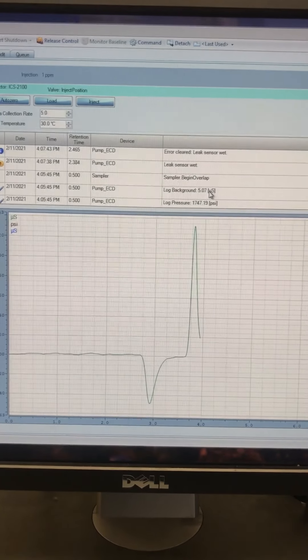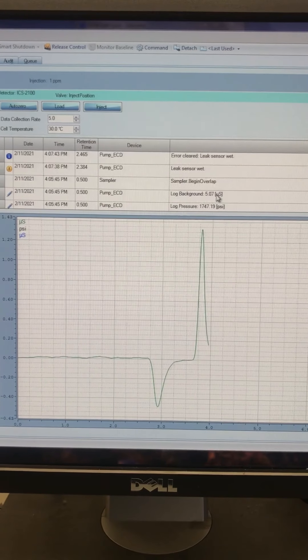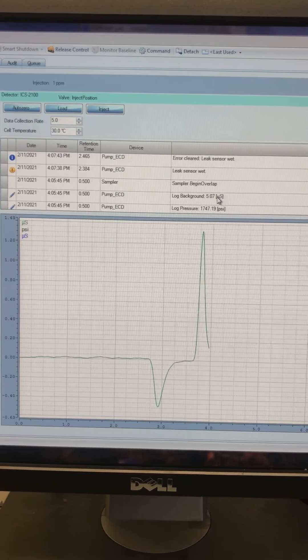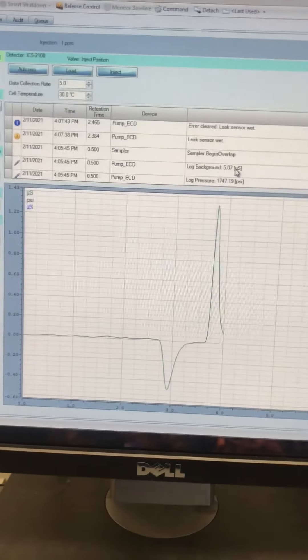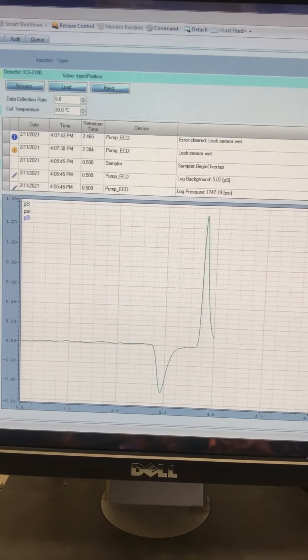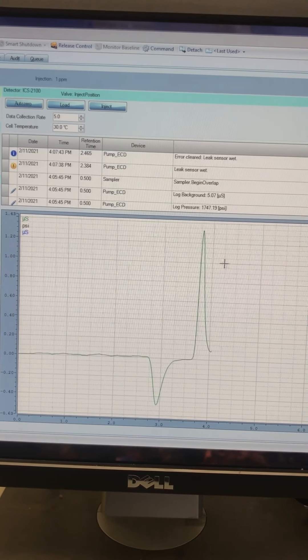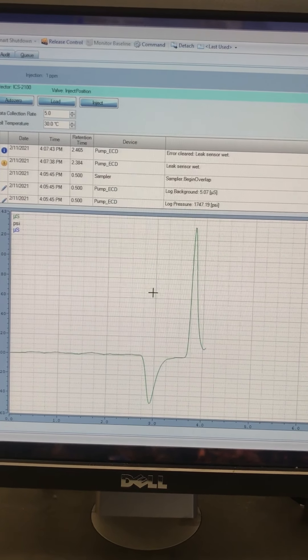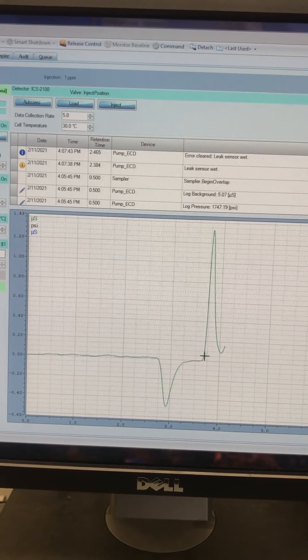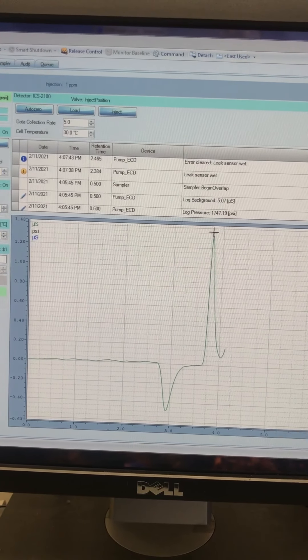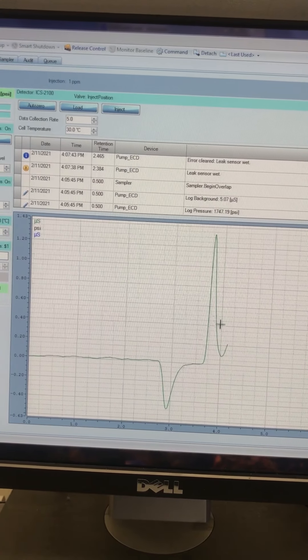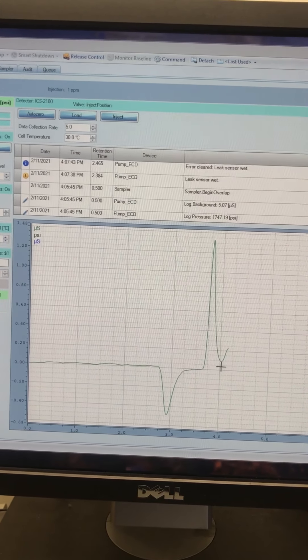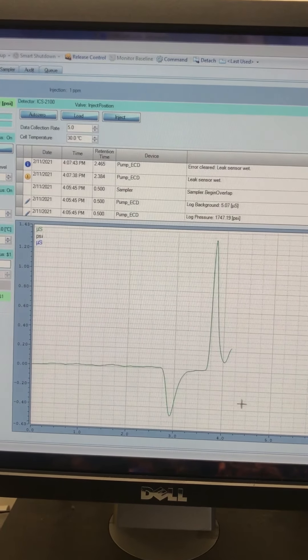And that spike right there is the chloride spike. The first one that shows up is chloride. So that is what we'll be interested in. Tomorrow I'll come back and show you a bit of how we get the data.